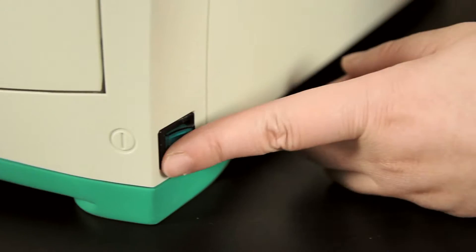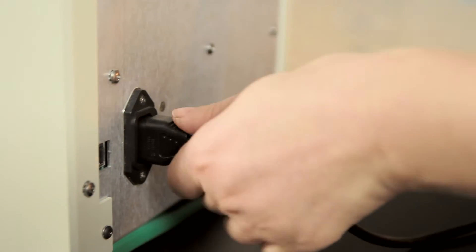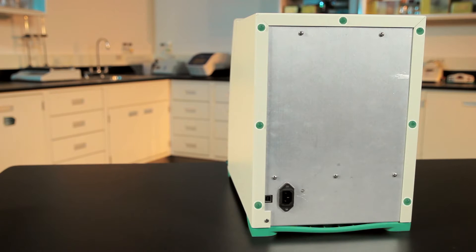To begin, turn off the instrument and unplug it from the power source. Then remove the seven screws around the outside edge of the GelDoc EZ, leaving the screw at the bottom left corner in place.